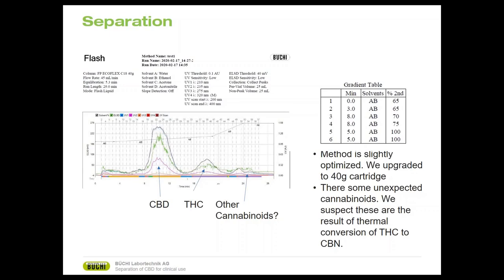So once you go slower in this case, you will have much better separation. And this is exactly what happened. You can see the CBD peak is perfectly separated and selected, and it is completely removed from THC. I'm 100% sure there's no THC in the CBD because the separation is very good. And you can also see the THC peak.